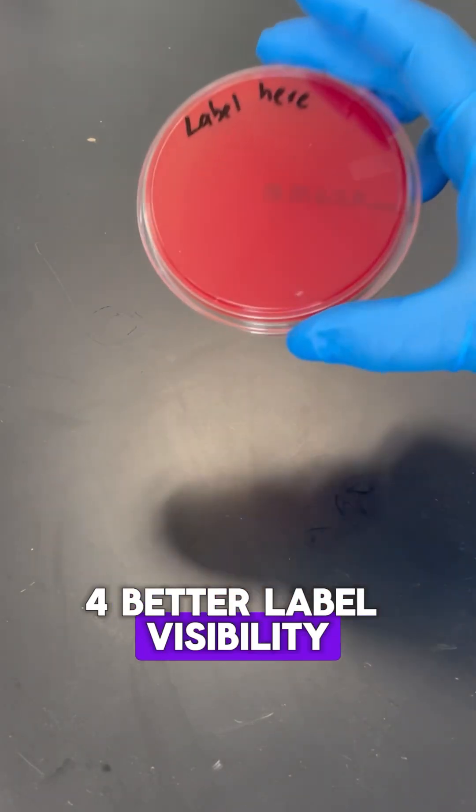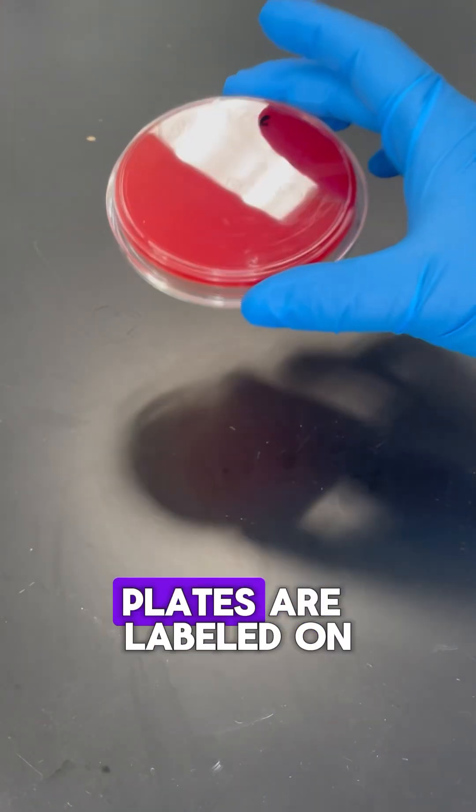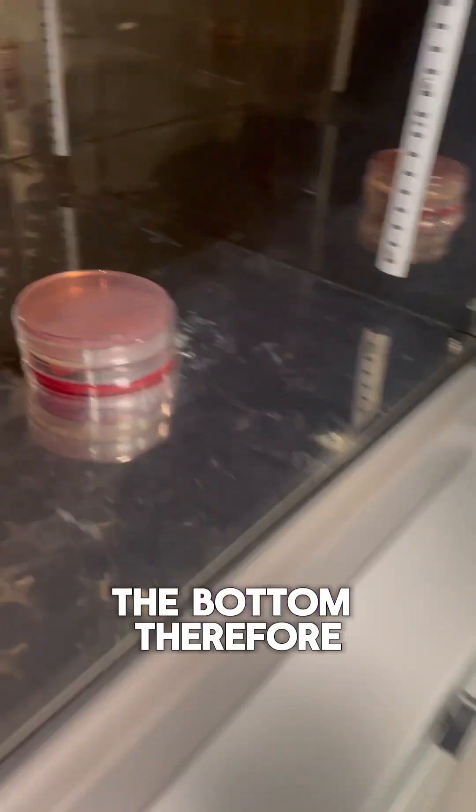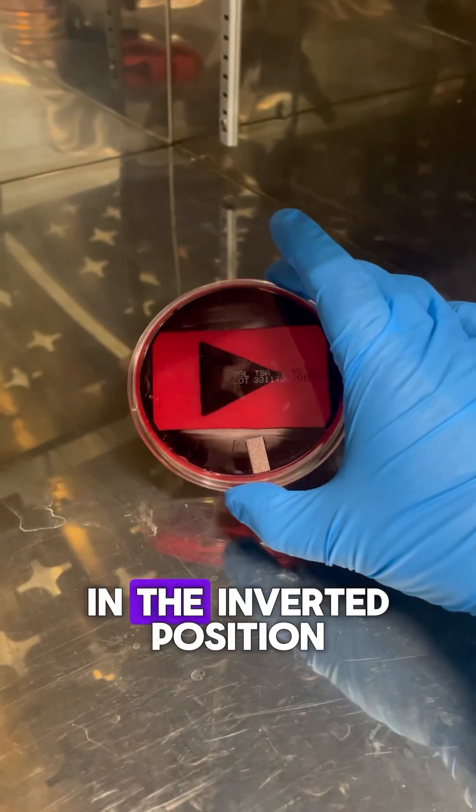4. Better label visibility. Because the agar doesn't move, plates are labeled on the agar side, the bottom. Therefore, labels are more visible in the inverted position.